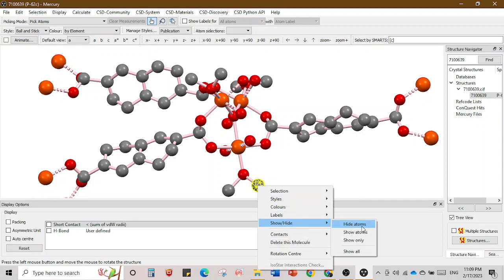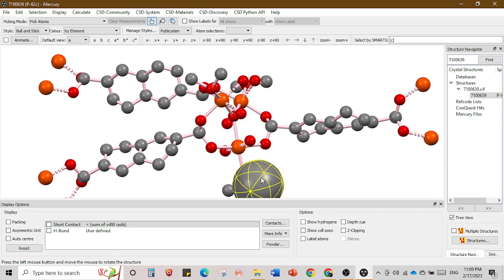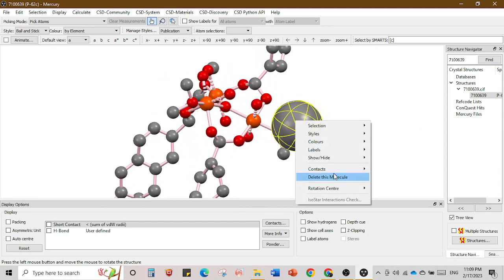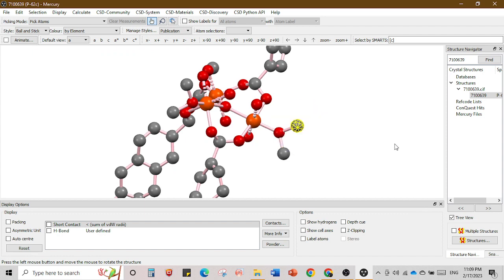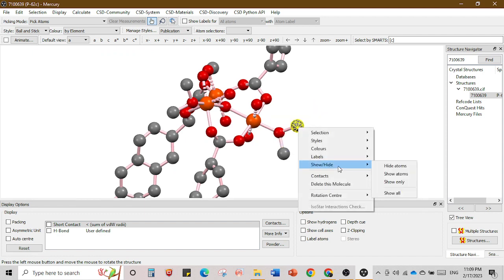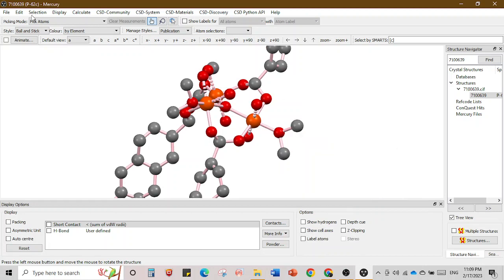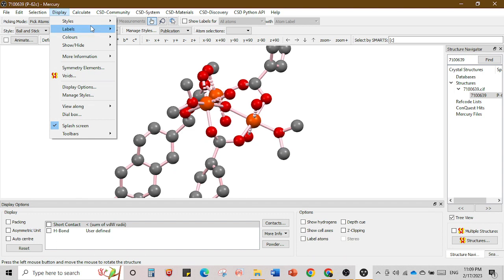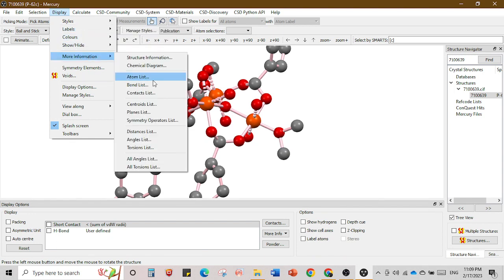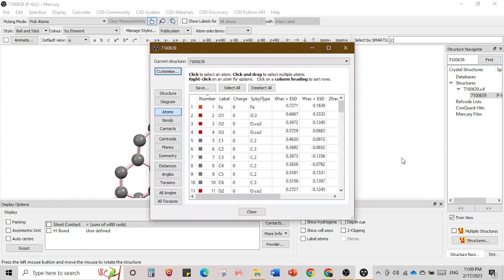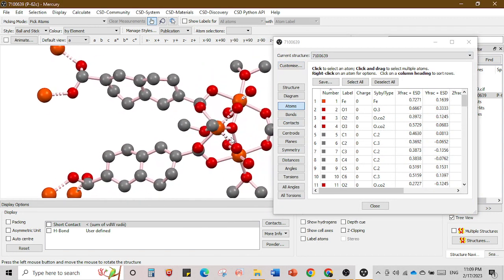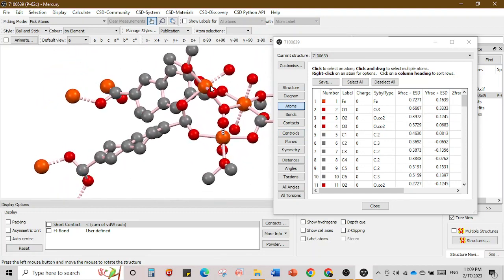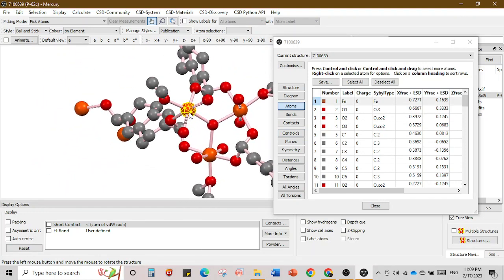If you select an atom that is connected to the whole structure and delete it, the whole structure will be removed. You can press Ctrl+Z to restore everything. Now if you wanted to remove one single atom, you right-click and then 'Show/Hide Atoms'. Alternatively, go to Display, then More Information, then Atom List — this gives a list of all atoms displayed in your molecule.